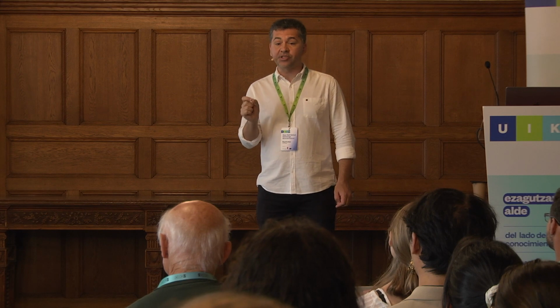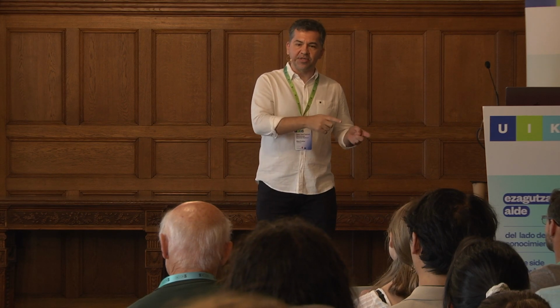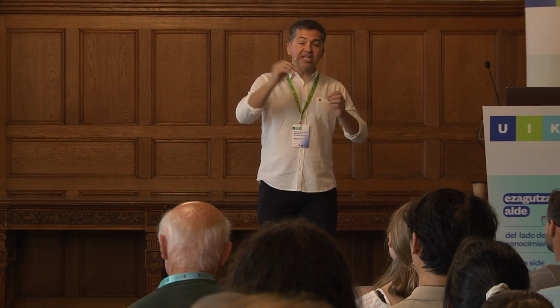when you go to the nano-FTIR, now comes the advantage of the synchrotron, which is a bright source. It means that the flux divided by the area of the source is way higher than a thermal source, which is a big source that has a big power, but the power spectral density is low.